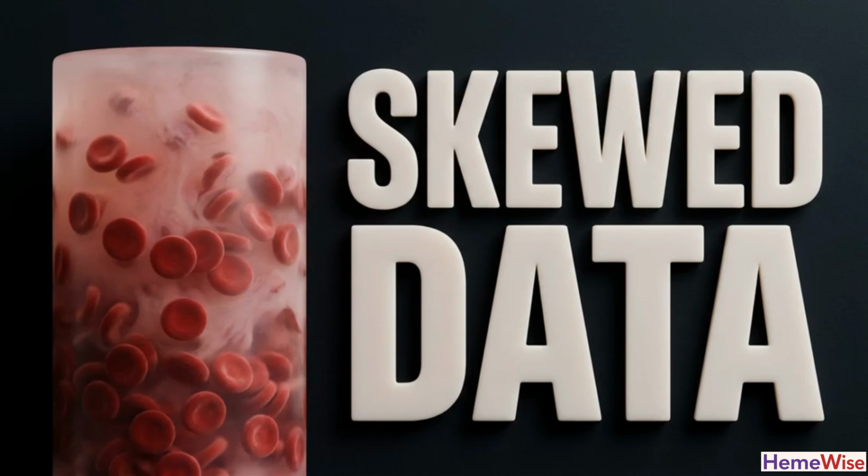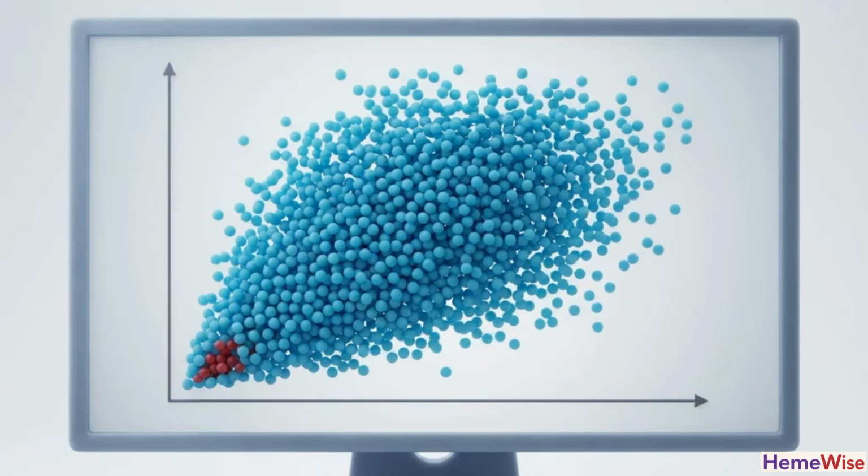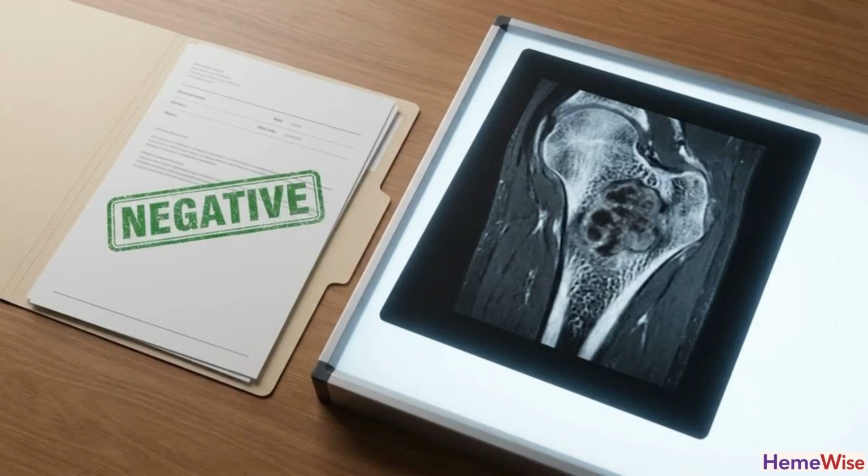Hemodilution causes false negative results in minimal residual disease flow cytometry testing. When a sample is diluted by normal peripheral blood, it obscures the actual malignant cell count, potentially leading to the report of a negative status when the disease is still active.